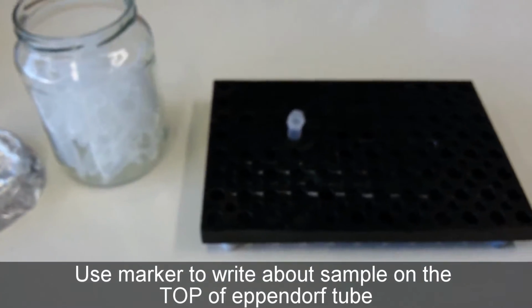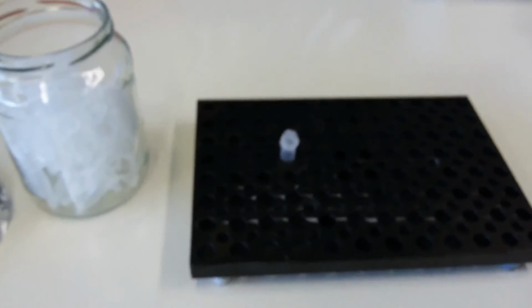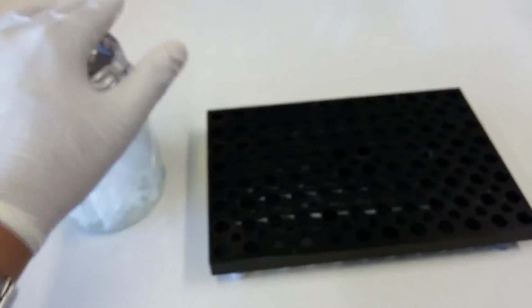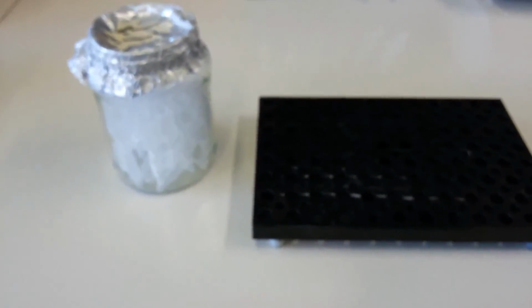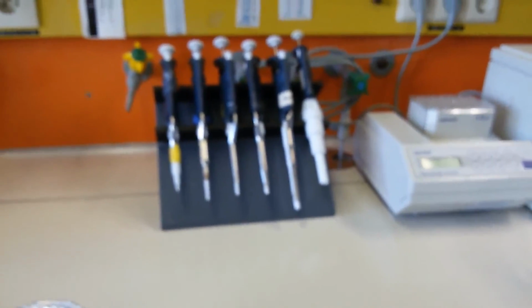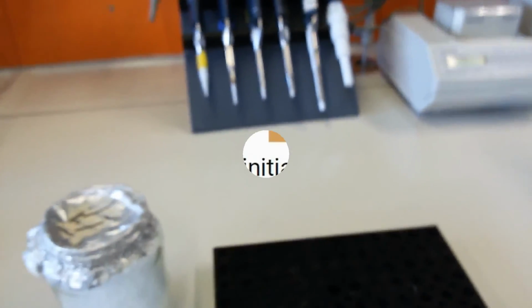This is the most important lab utility. We always use Eppendorfs and Eppendorf stands. We do most of the reactions and most of the tests in Eppendorfs, so you should know that. So far these are the common lab utilities which I think you should know. In front of them you see some more stuff, and we will talk about them in a while.